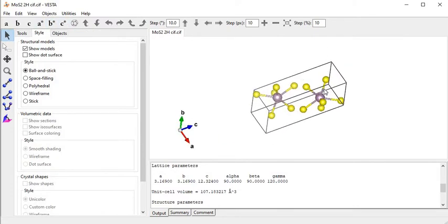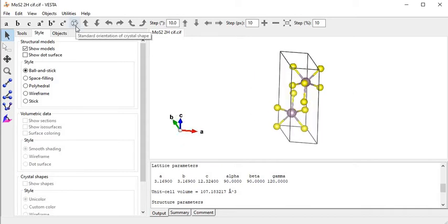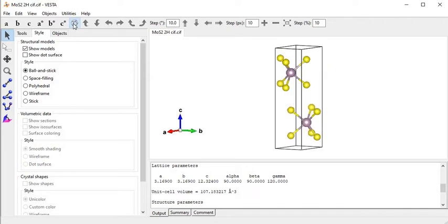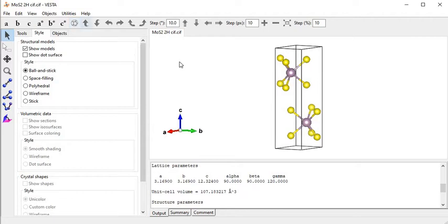After moving this structure in an arbitrary direction, I can click on the standard orientation of crystal shape. Let's see what happens after clicking this - it looks like a standard, the best 3D view of the crystal. We can get this view by clicking 'standard orientation of crystal shape'. Now I am coming to how to rotate this crystal.